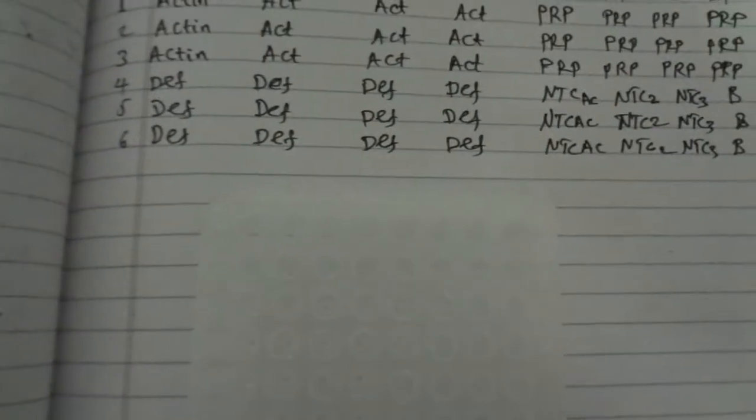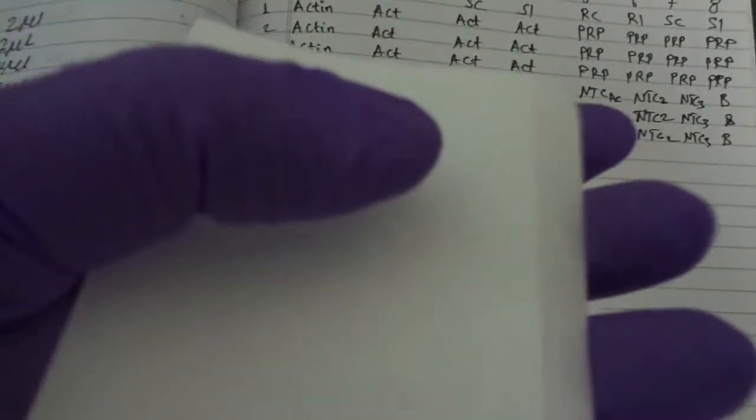Now after loading all of my samples, I need to seal with optical plate seal. This optical plate seal film is designed for this purpose and is used to seal the plate. The cover paper, the white one, is removed, so the plastic is transparent and can easily pass light through it.